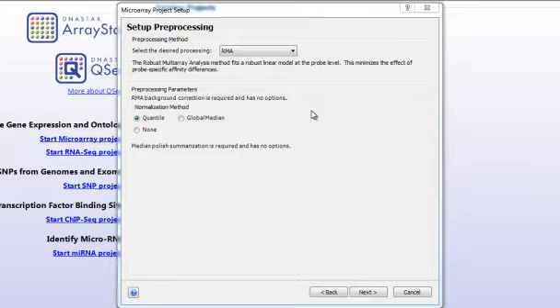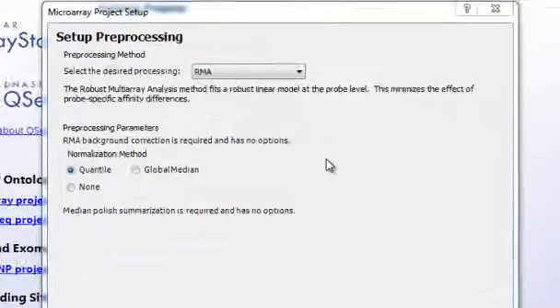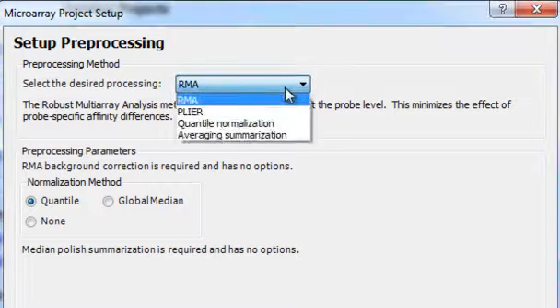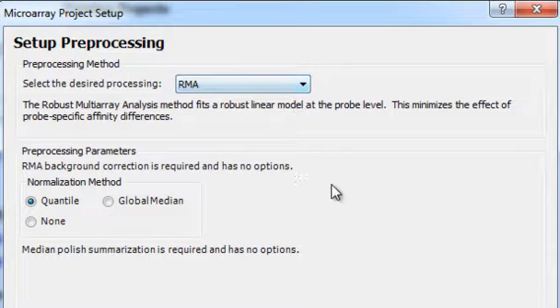After importing the microarray data, you can select the normalization method in the Setup preprocessing step. Select both the normalization method and the preprocessing parameters. If ArrayStar can confirm that this data has already been normalized, then this step will be skipped.